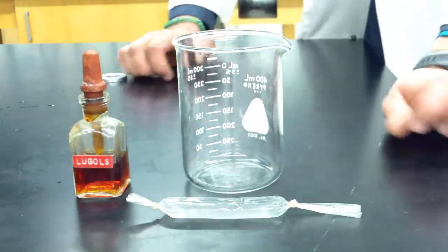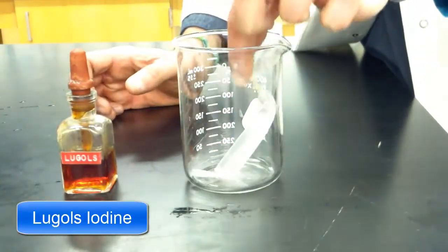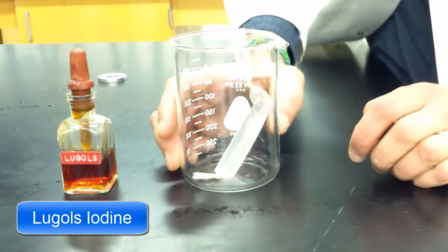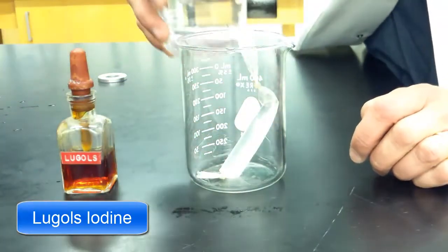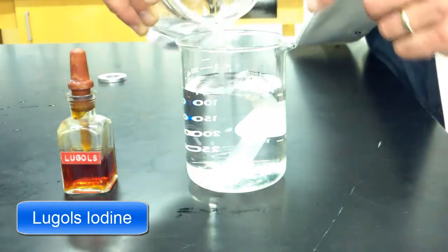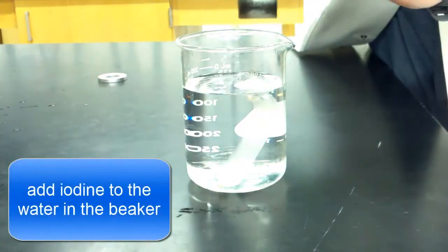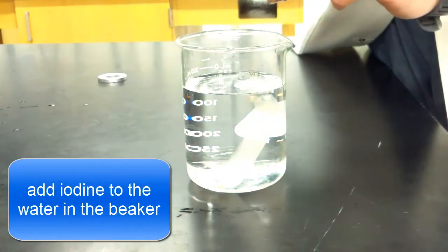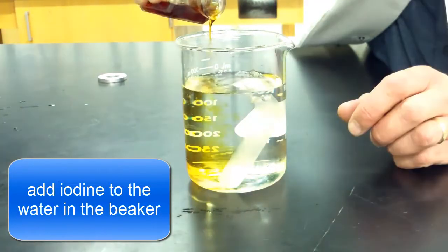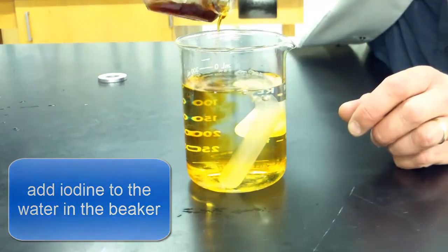Okay the final stage of this setup, we're ready to assemble our cell. So what we need to do is we need to put our cell into a 400 milliliter beaker and then fill it with water until it is covered. And just fill it enough so that the entire cell is submerged in the water. And now you want to add several drops of iodine until you get the beaker a nice amber color.